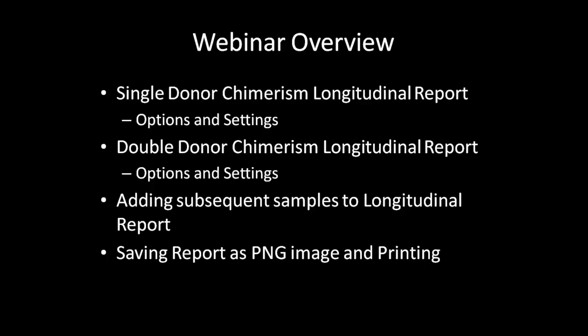Before beginning this webinar, please review the ChimerMarker introductory and double donor webinar if you have not done so already. We will first talk about the longitudinal report for single donor chimerism analysis and the different settings, then move on to the double donor longitudinal report and settings, and finally discuss how to print the report and save it as a PNG image.